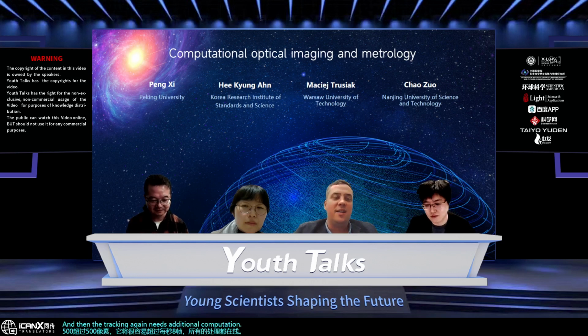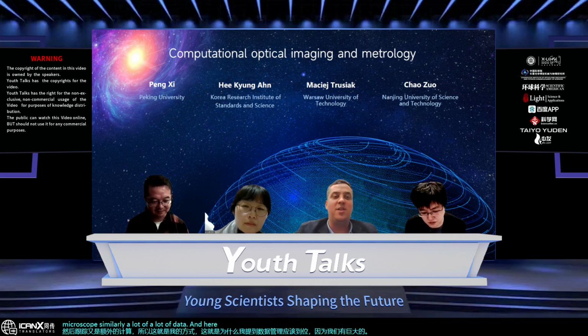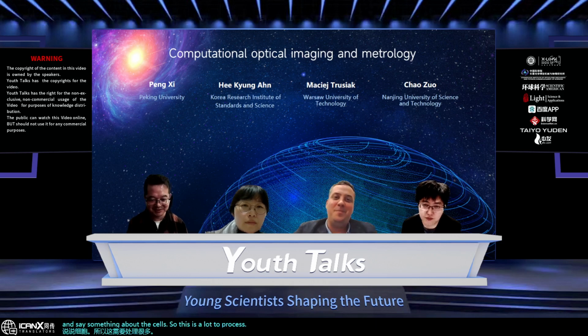So that's why I mentioned that the data management should be in place, because we have enormous data, like Professor Chao Zuo said, with the Fourier ptychographic microscope. Similarly, a lot of data. And here with the time lapses, for example, we're capturing data for 5 days every 5 seconds for this entire field of view, and then we need to do the tracking and say something about the cells. So this is a lot to process. Yeah, physical constraints for the cellular tracking.